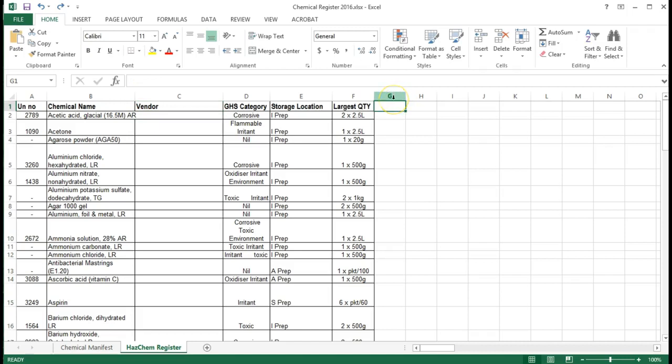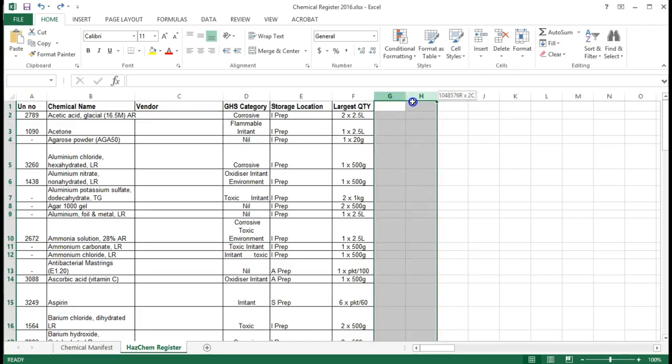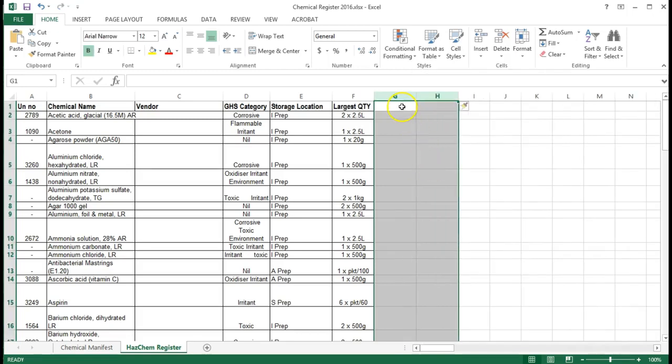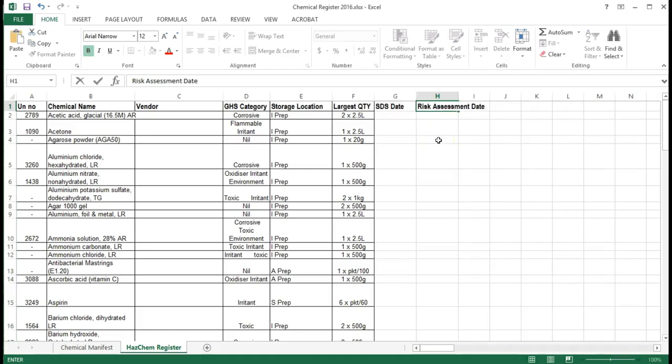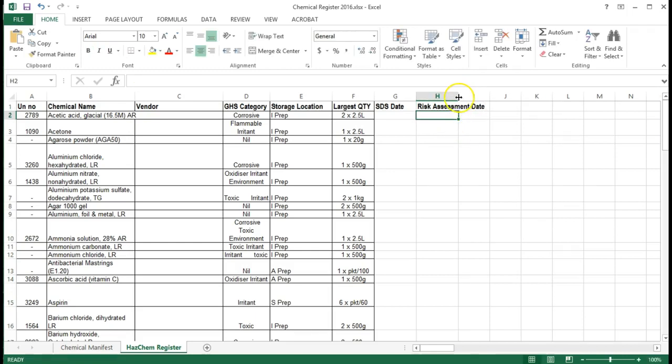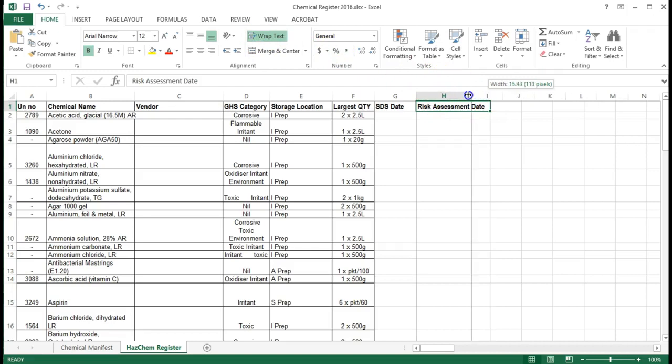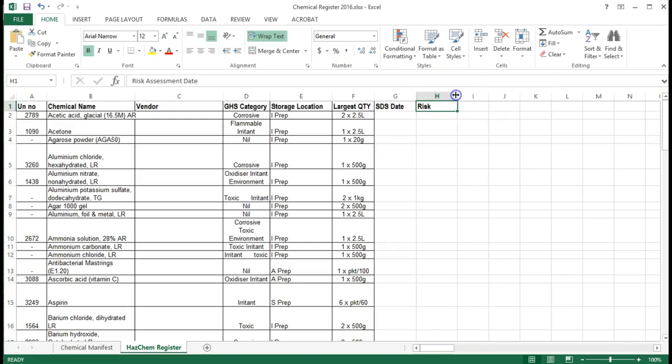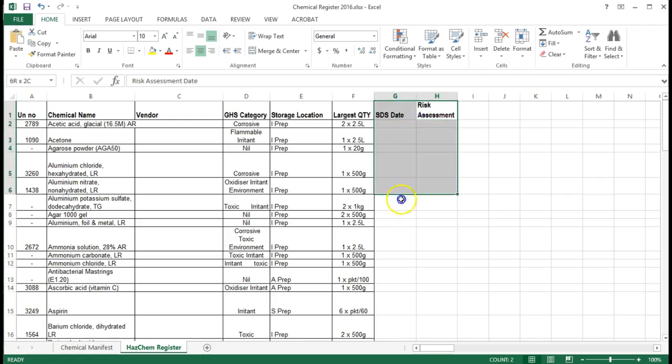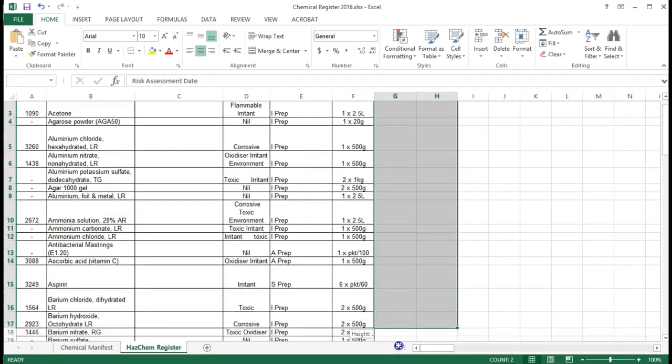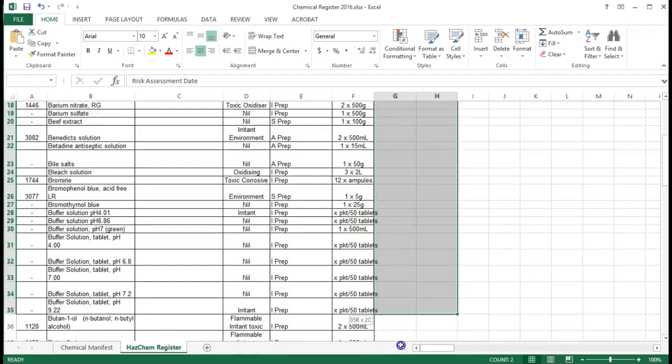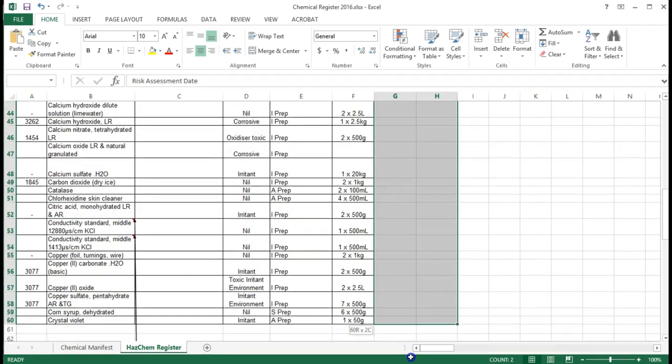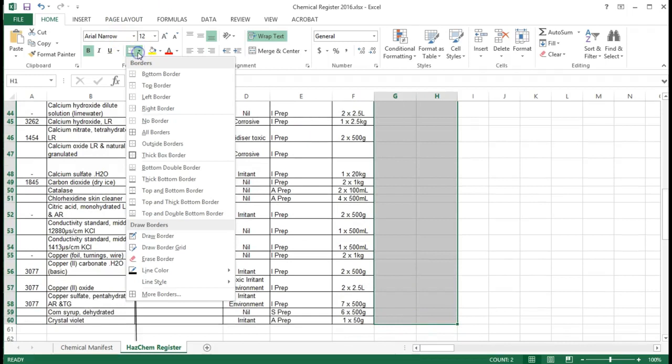Next we're going to insert another two columns to the right of the spreadsheet. We're going to insert them so that we don't have to reformat our title. So type in SDS date and risk assessment date. You'll notice that you'll need to resize the column for risk assessment date or you can wrap your text cell and move the column down. You'll notice that you've lost your grid lines. You can easily pop those in by selecting the area, just like we did in part two, and putting a border around it.